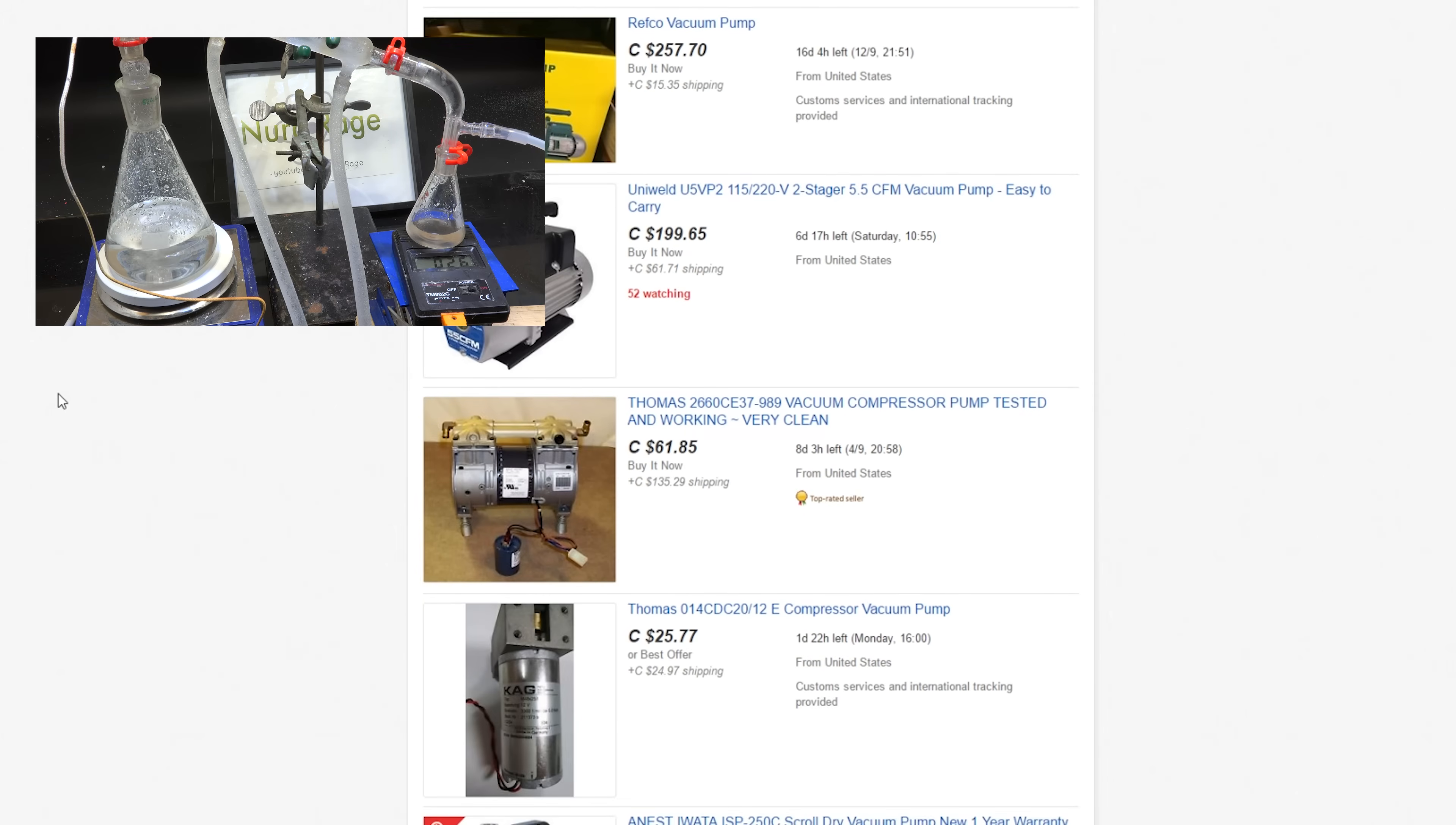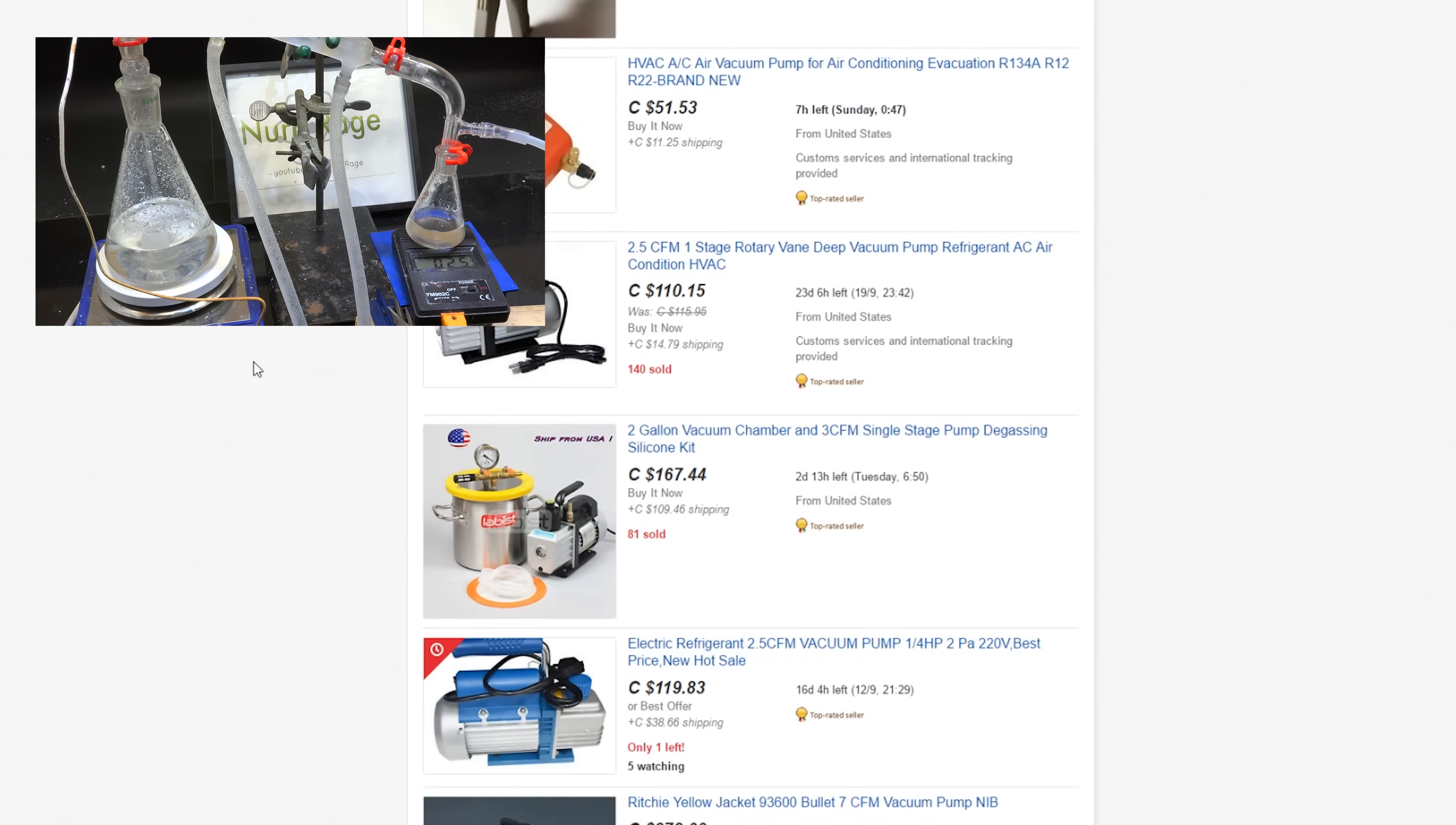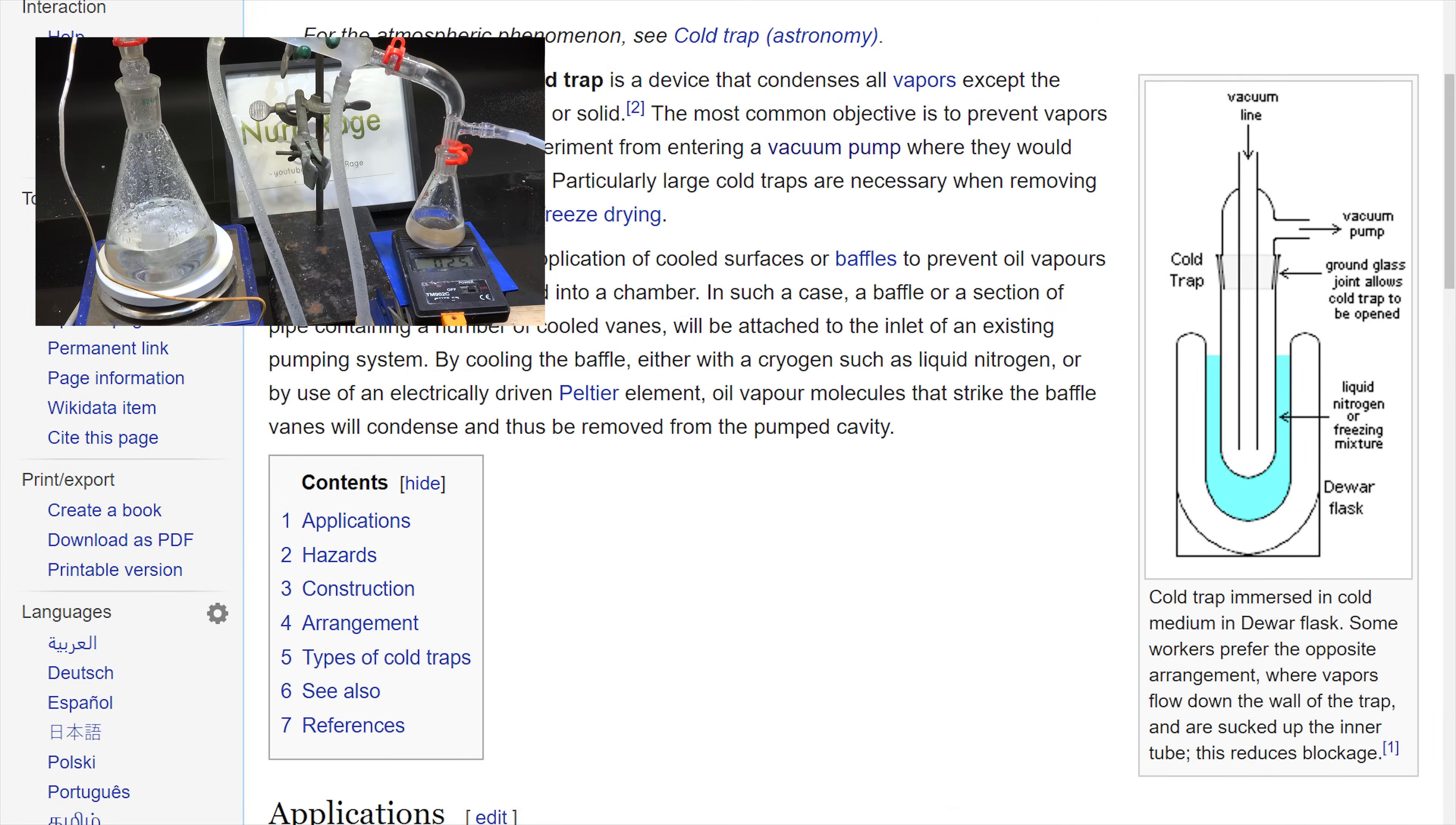Unfortunately the major drawback of such pumps is that they can only really handle atmospheric gases like oxygen, nitrogen, argon and so on. Water vapor and chemical solvent vapors will condense into the oil inside the pump corroding or wearing the mechanisms. Professional chemists use liquid nitrogen cooled cold traps to trap, condense and freeze the gases before they reach the pump.